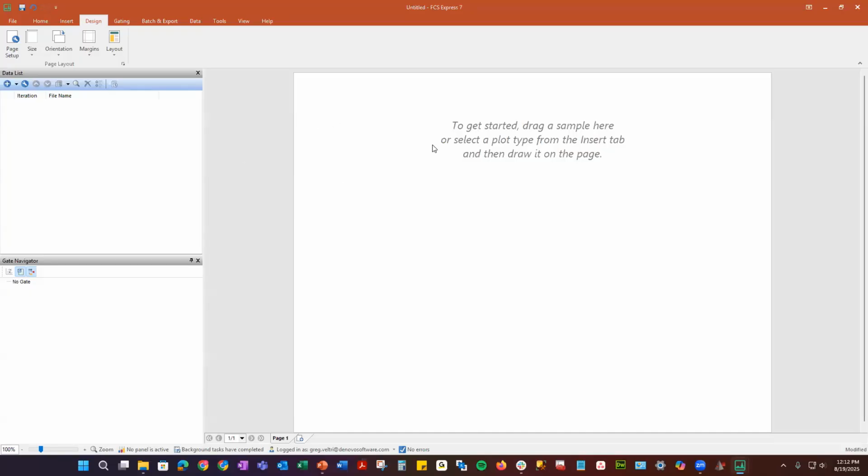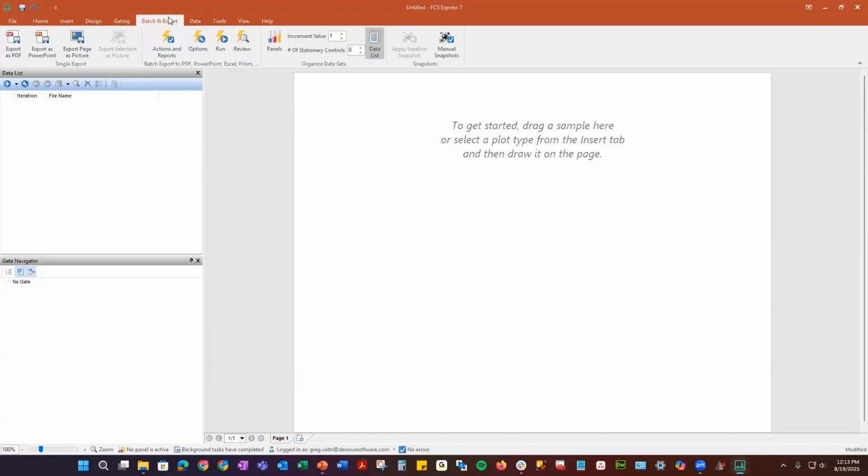So you're going to see as we put things together, I'm going to put it together as if I was going to tell a story about the data that I'm working on, so that I can then batch this if I want into a PowerPoint or a PDF. So I can easily just go to a lab meeting or send this to a customer and say, here's your data, this is what it looks like. All right. And then in gating, we have all the other gates, the ellipse, the polygon, freeform, there's a well gate, we have markers, we have quadrants, etc.